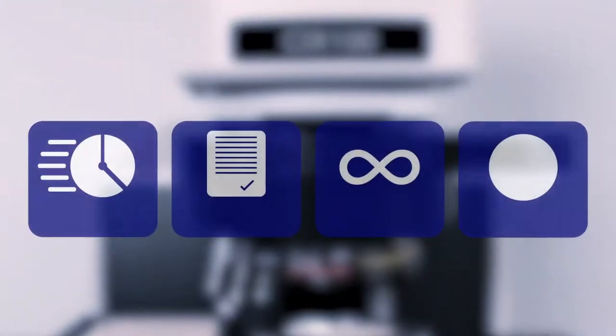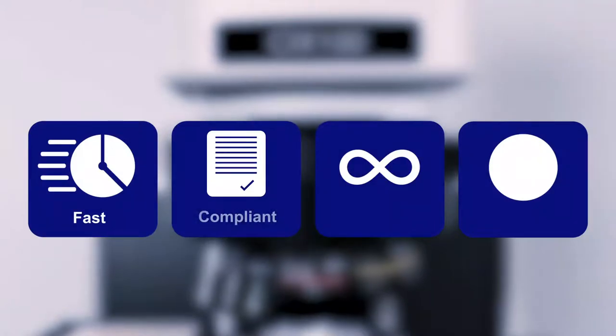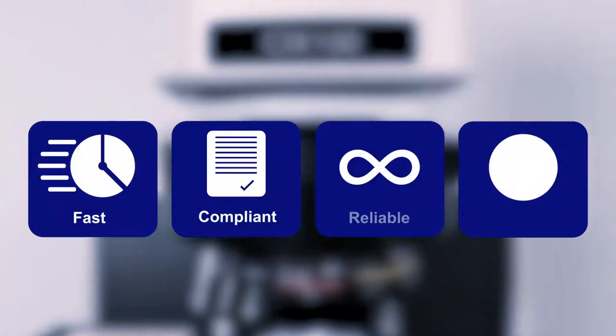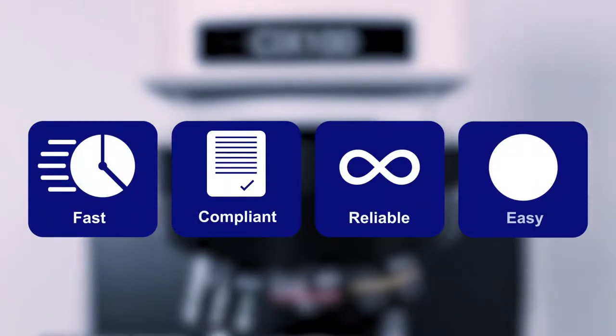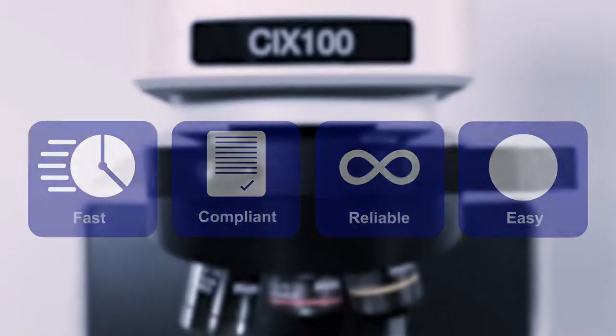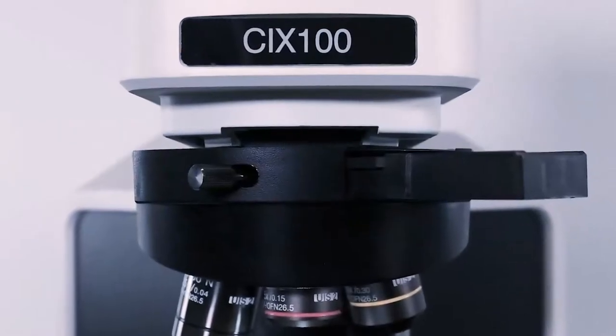The Olympus CIX100 system is designed to meet the cleanliness requirements of modern industry and national and international directives.